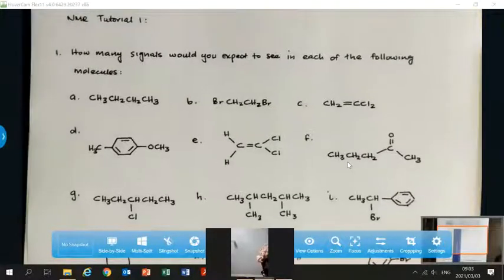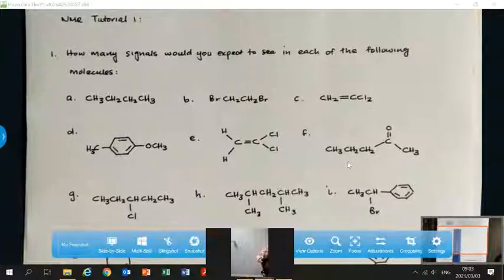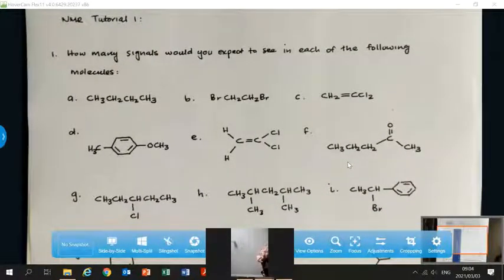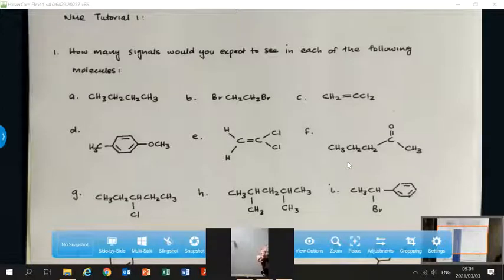Great. So that was the first part of this lecture. The second part of this lecture is tackling these questions. So it's good for us to know, before we even get to look at the spectrum, how many signals we are expecting in the spectrum and whereabouts we are expecting these signals.